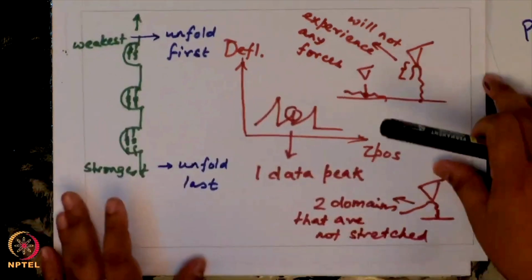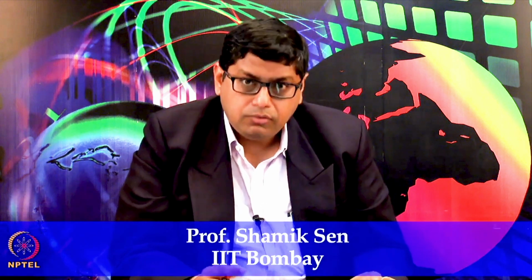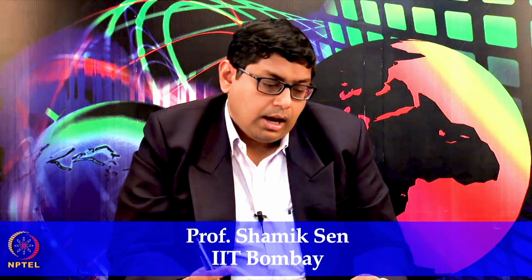Okay. So, with that I end our lecture today. To summarize, we have seen how the AFM can be made use of for studying protein unfolding, and what is the signature of protein unfolding. Okay, so based on this signature I can claim that this is protein unfolding. In the next class we will continue with this and see how to analyze our data and what the design principles are for coming up with protein constructs for understanding the protein unfolding of fibronectin. Okay. Thank you for your attention.